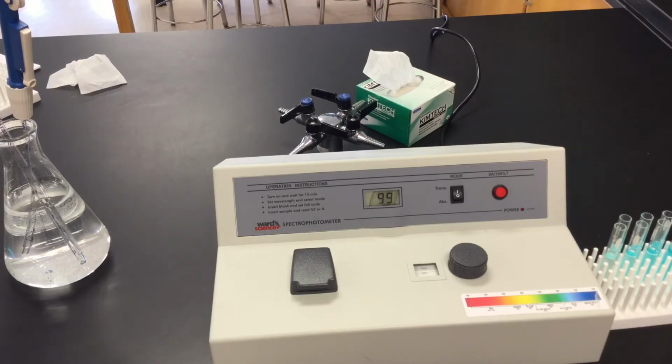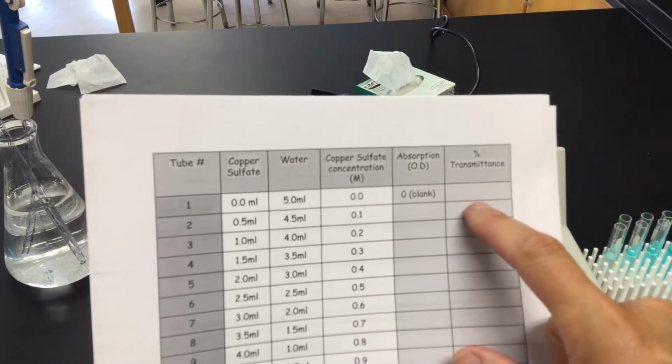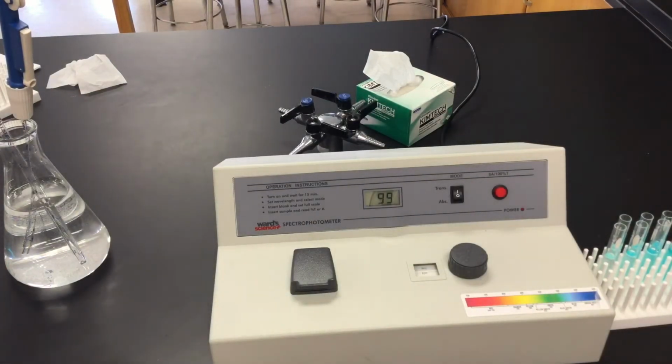Should it be 100? Absolutely. Are these machines not as calibrated as they should be? Yeah, they're going to be close. There's always going to be a little scientific error. I would still put 99. It's not like it says 27 or something really far off. It's at 99. So my absorption for plain water at wavelength 620 is 0. My transmittance is 99. Then all I'm going to do is go through and switch tubes.